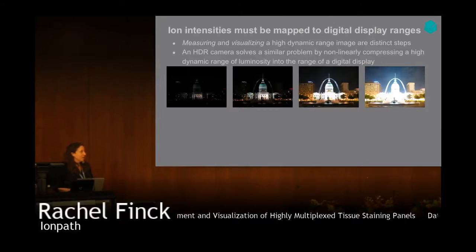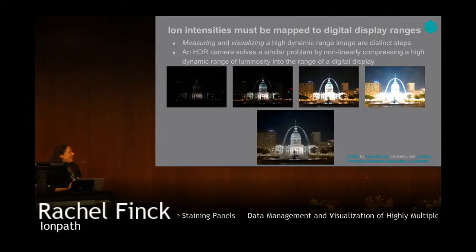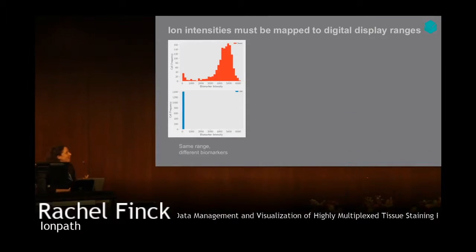But that comes from this mapping of what is the light intensity that my camera recorded and remapping that onto your digital display. And just as a kind of bringing it back to biological data, what a lot of you are used to from looking at cytometry data is maybe a histogram of intensity. It could be intensity per cell. If it's an image, maybe it's intensity per pixel. I'm looking at that after some transformation, and with the range you set having a huge impact on it.